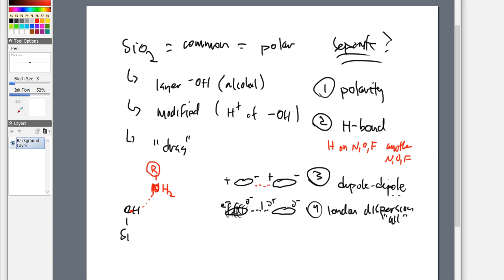So just because something's non-polar doesn't mean that it's going to drastically race up the plate or through the column. It's going to go fast. Absolutely, it will go fast. But we start to see differences in how these components interact with the stationary phase, because they all are contributing in a different way depending on the structure or the compound that they find their home with.